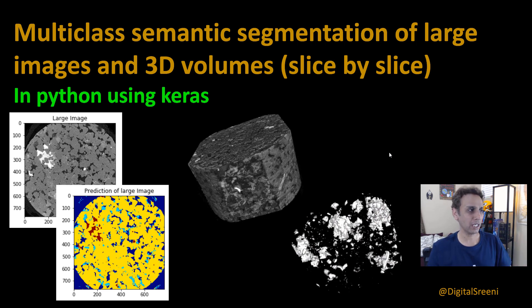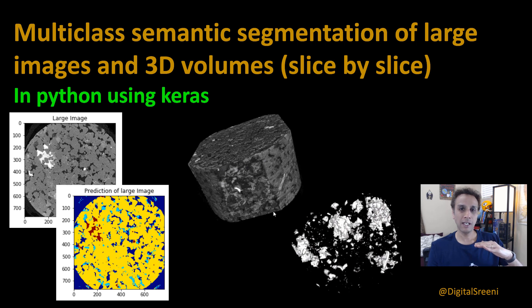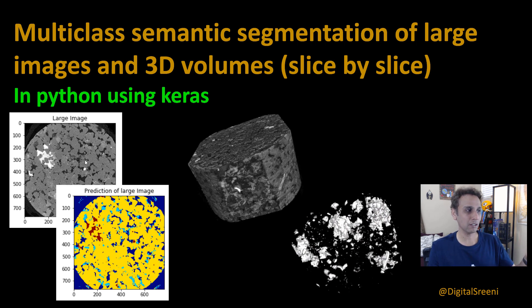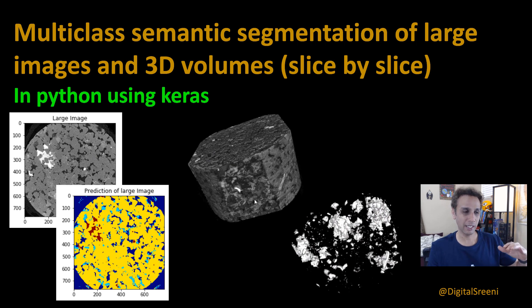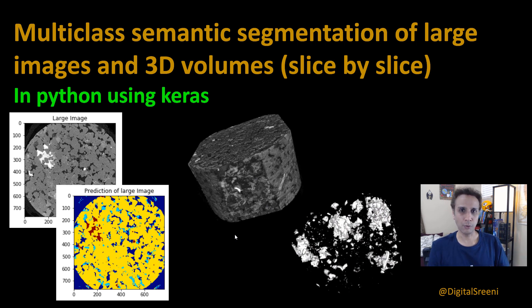In a 3D volume - if you look at this example, I have a large volume divided into multiple slices. I took each slice, which is a large image, divided them into smaller patches of 128 by 128, applied the trained model, stitched them back together, and did the same for each slice, stacking everything together so we end up with a segmented volume. It's much easier than it sounds.